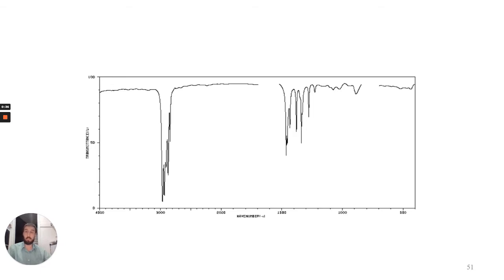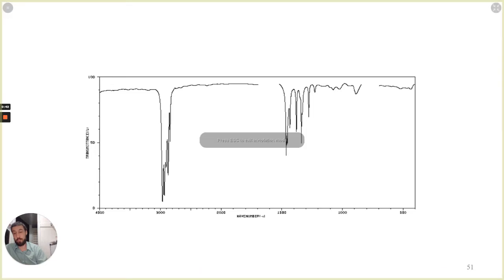Five seconds. Bing. Okay, what do we got? So, first and foremost, what do we have? We have some IR spectroscopy. Oh my goodness. Let's try that again. This is IR spectroscopy. We take a look.